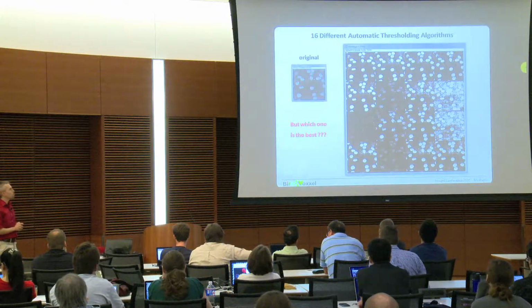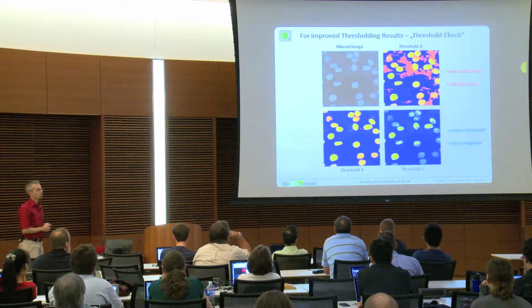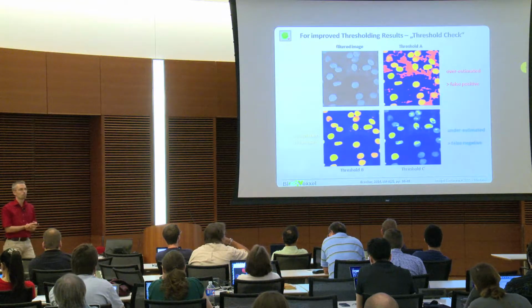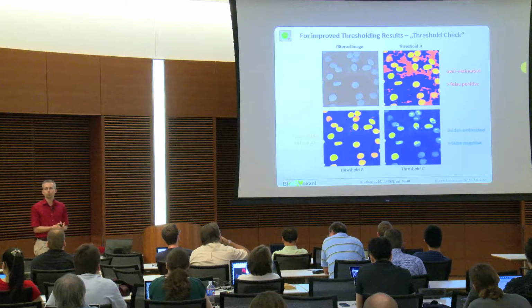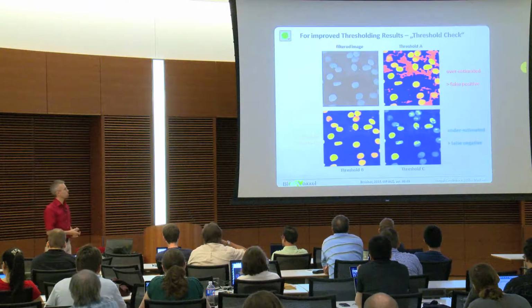And that is again where the toolbox comes in, because the toolbox offers you the same thing. So it uses this auto threshold provided by ImageJ. Then it color codes them in comparison to the original image. And that should help you in making that decision. That's not an absolute tool which tells you use this and you're happy. This just should make it easier.